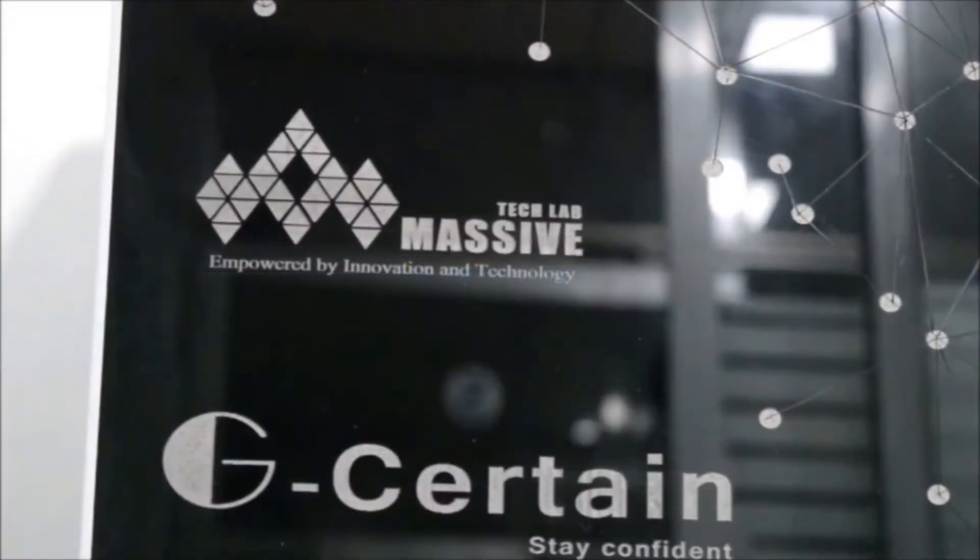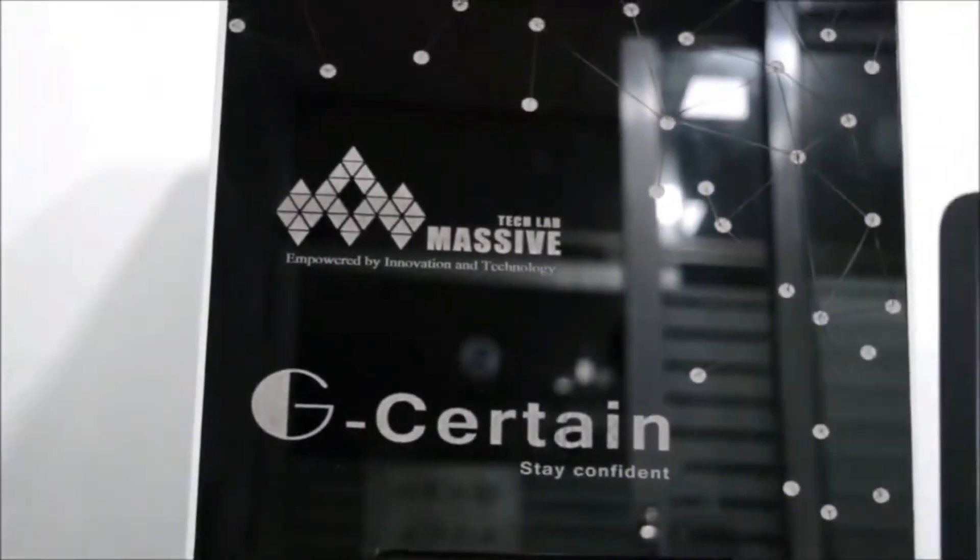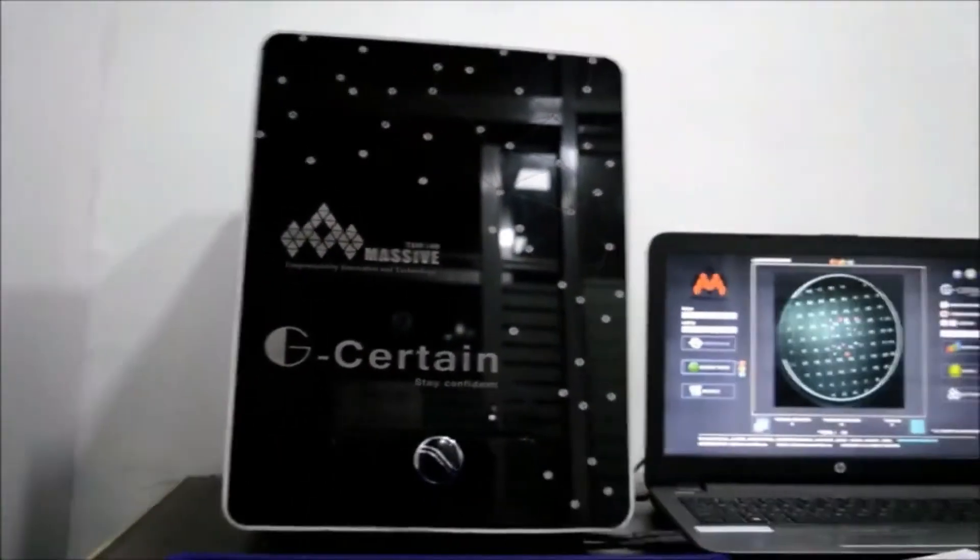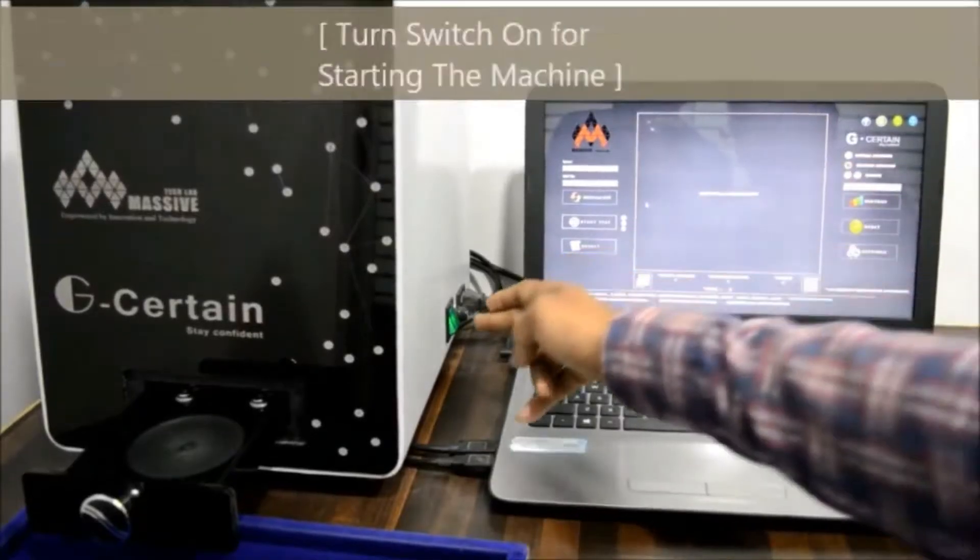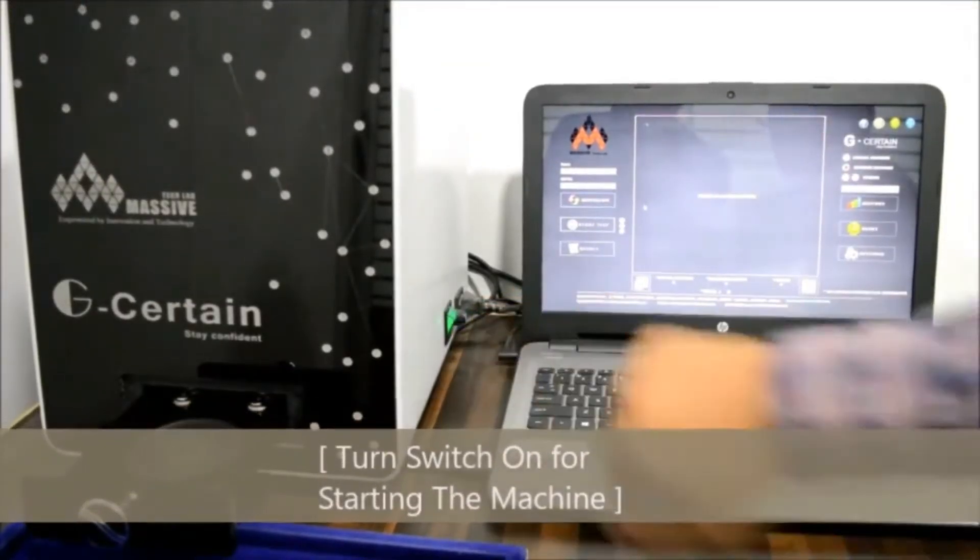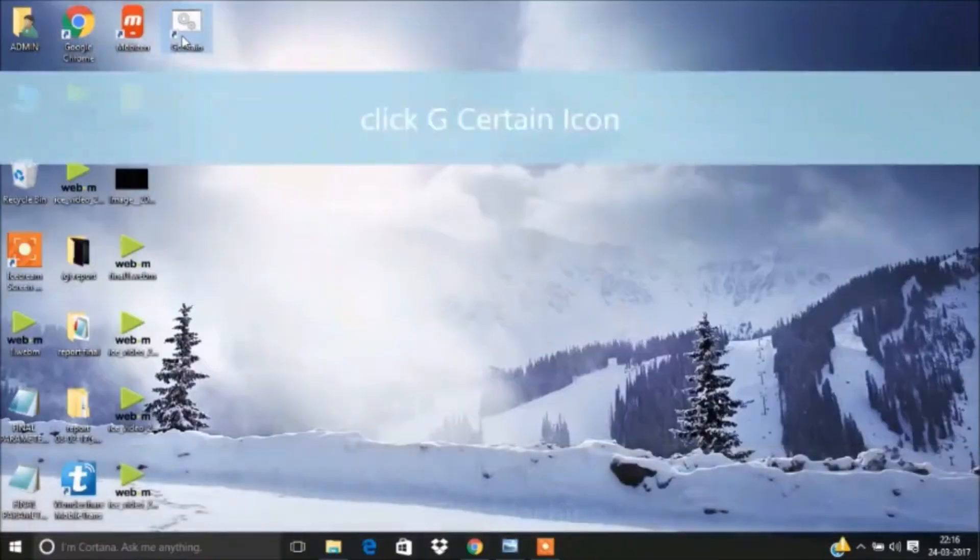Power on the machine to proceed with machine operation, followed by double clicking on G Certain icon.